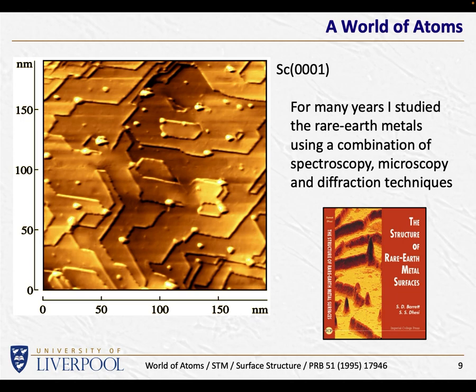With scanning tunneling microscopes, we wanted to generate nice flat surfaces, but sometimes the surfaces weren't as flat as we would like. This is an image in which you can clearly see there is terracing. Rather than having something beautifully flat, like the tennis courts outside, there are clearly steps and terraces. But that's the way the atoms want to arrange themselves in this particular set of elements.